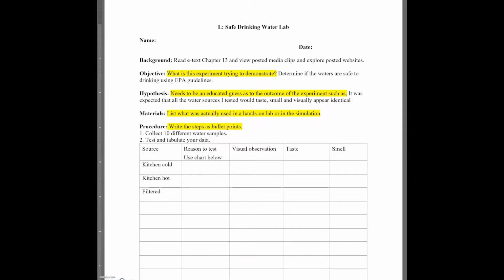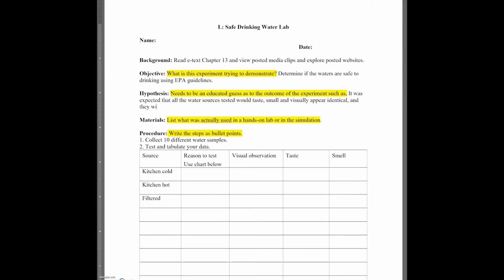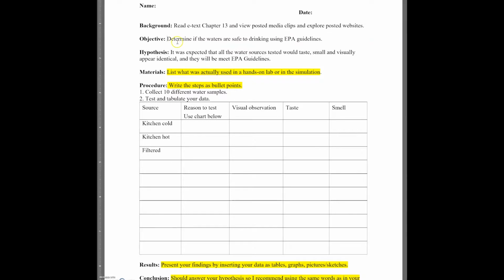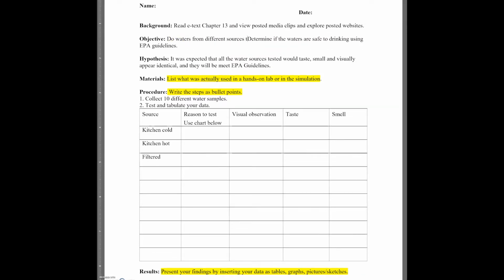As normal, we can start with our lab manual. The highlighted areas serve as Professor Etter speaking directly to us. Notice that being further along in the semester, we have less highlighted areas than we did in the beginning. This means we are able to modify or control more of the experiment. We will need to fill in more areas of the objective.